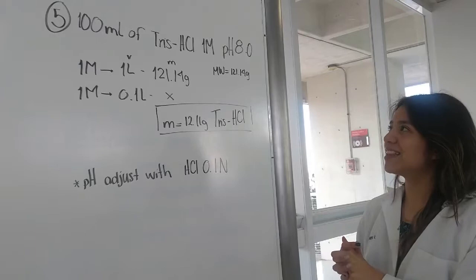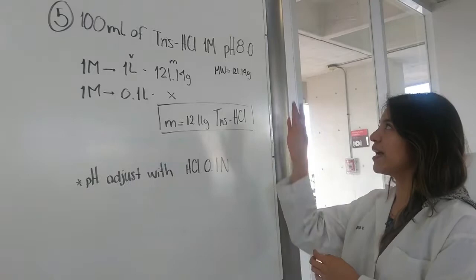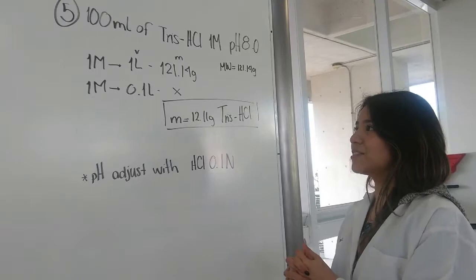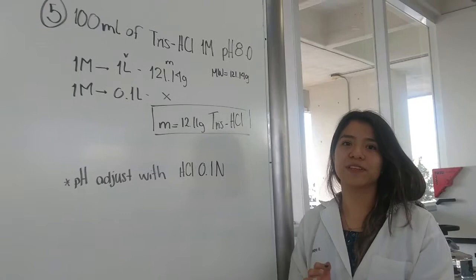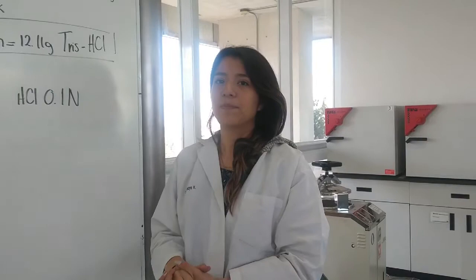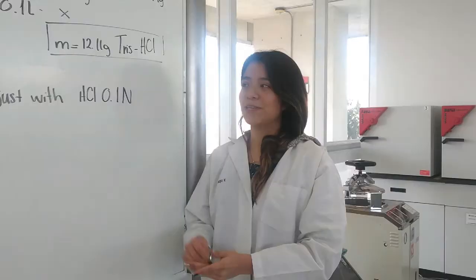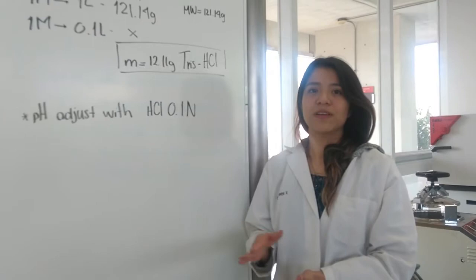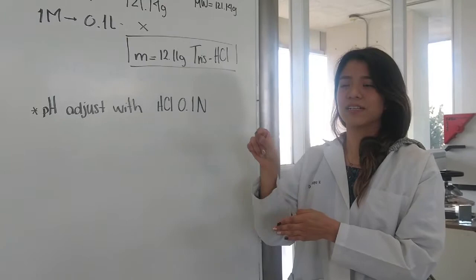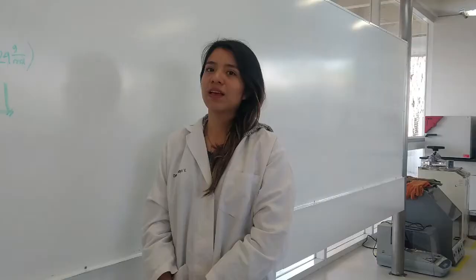For the next solution, we prepare 100 milliliters of Tris at 1 molar concentration. This solution requires pH adjustment to 8. We first calculate the grams of Tris needed using the standard protocol, then dissolve them in 100 milliliters of distilled water. The pH is adjusted using hydrochloric acid with a potentiometer: the solution is placed in a beaker and drops of hydrochloric acid are added until the desired pH is reached.